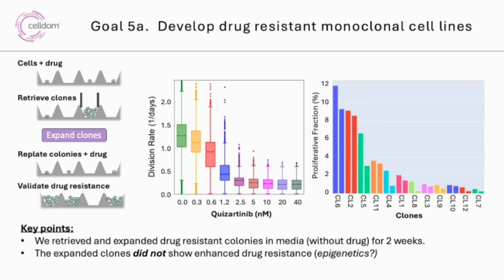So this was a very clear state in which a functional property of a cell population was not remembered. And that is because the property was based on selective pressure. Once the pressure was removed, then these cells quickly resorted back to their natural state. That's the working hypothesis here, although we were expecting to actually have developed drug-resistant cell lines.